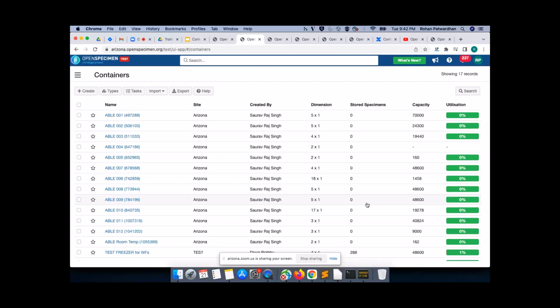And I think we've just discussed in detail the most common occurrence that happens to us: we're running out of room in shelf 1 for project X, and we need to make sure we've got more boxes available. We end up making more of those changes than we think, because when we plan out a project, we're never quite sure how much we're going to get.